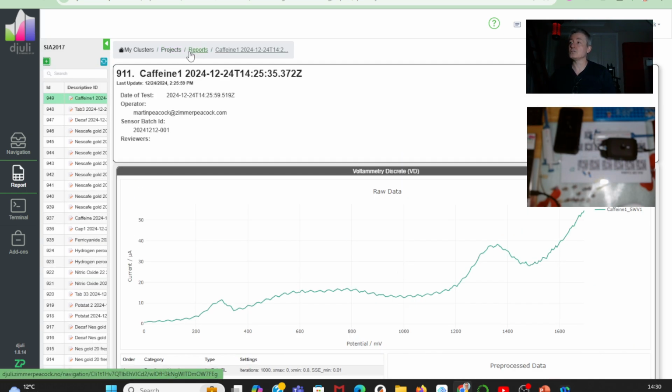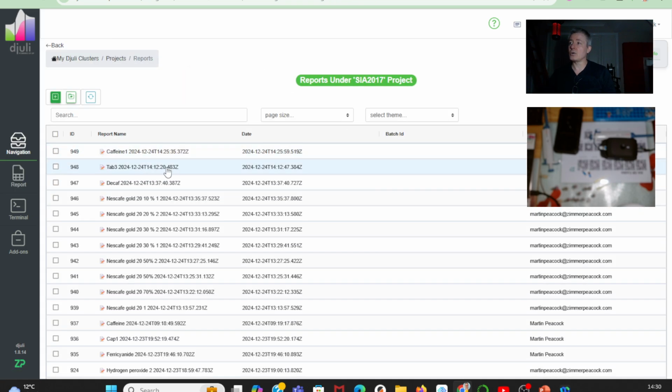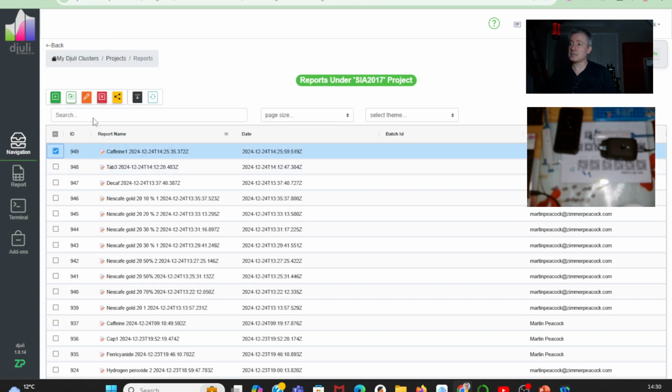I just want to go back to one of the premium features of Djuli. If I go in here, I can choose this, and I can share the report, even though it says incomplete. If you grab this and send me that URL, I should be able to get in there and see the raw signal.